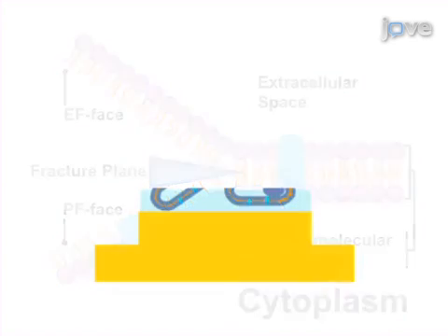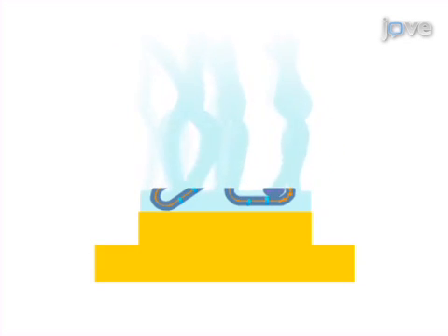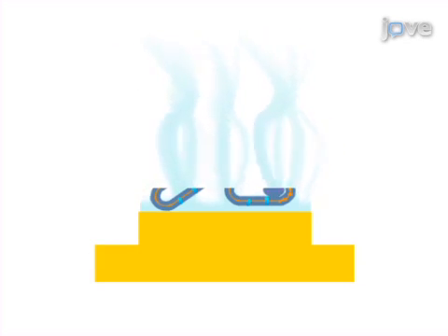As an optional additional step, underlying features can be revealed when water is etched from the surface of the fractured specimen by positioning the cooling microtome arm over the specimen stage to create a temperature differential, which causes water to sublime from the surface.